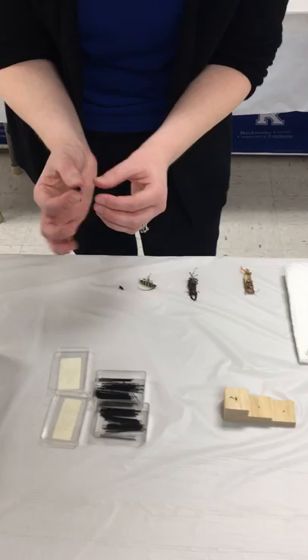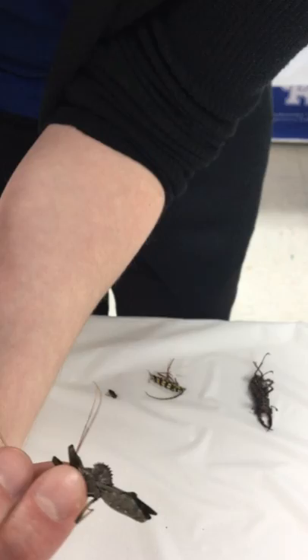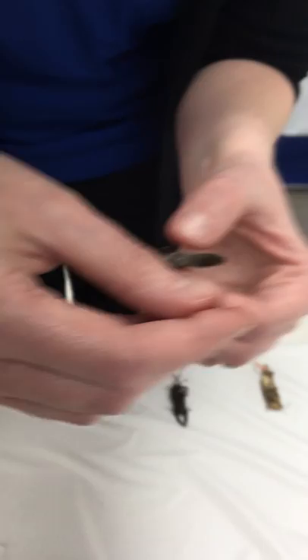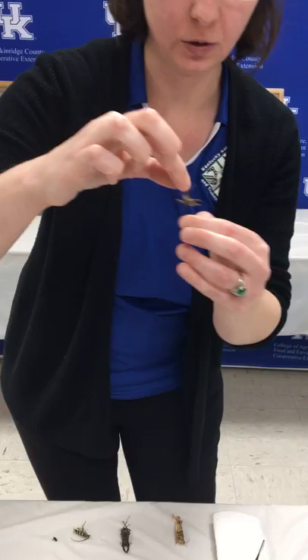Next we have a wheel bug, a type of true bug — for all true bugs we're pinning a little to the right. Normally you'd see the characteristic triangle shape like in a stink bug, but on this wheel bug the wheel is covering up that triangle piece of the prothorax we're going to pin into. I'm going to pin on the right as best I can, get him as straight as I can, and place him on the pinning block — trying to get him as level with the ground as possible so he looks lifelike.